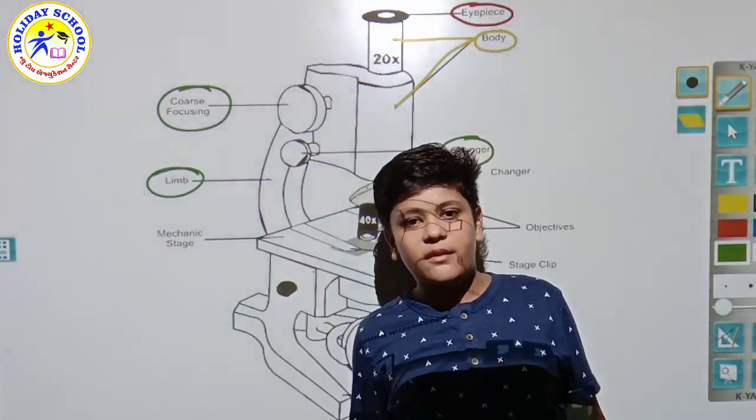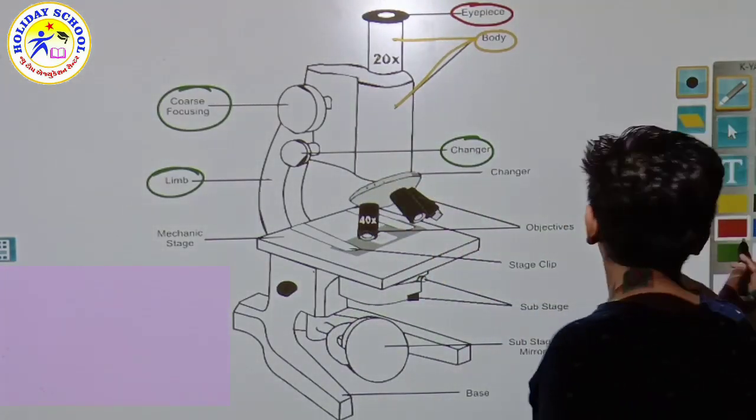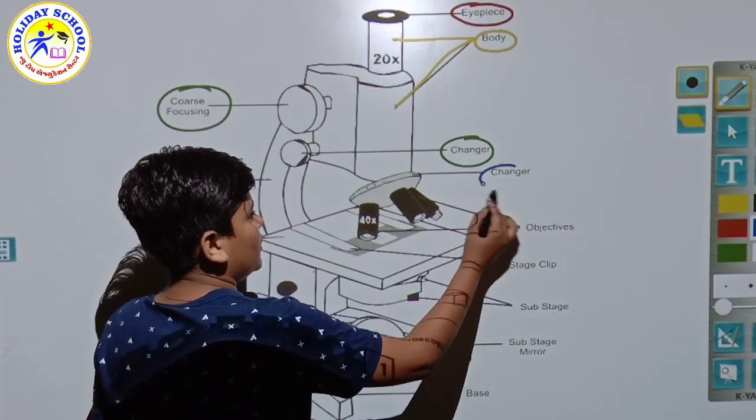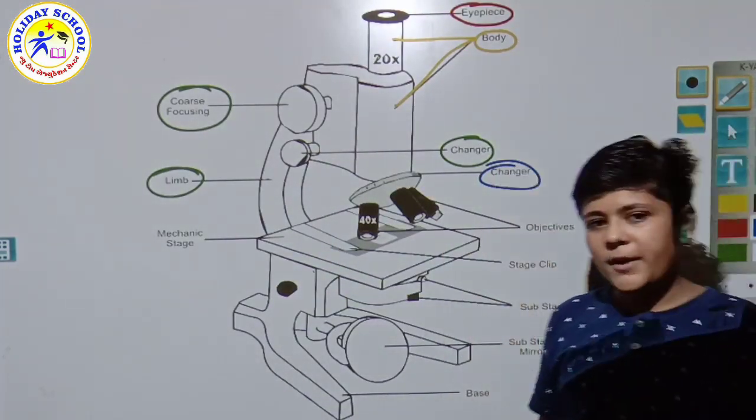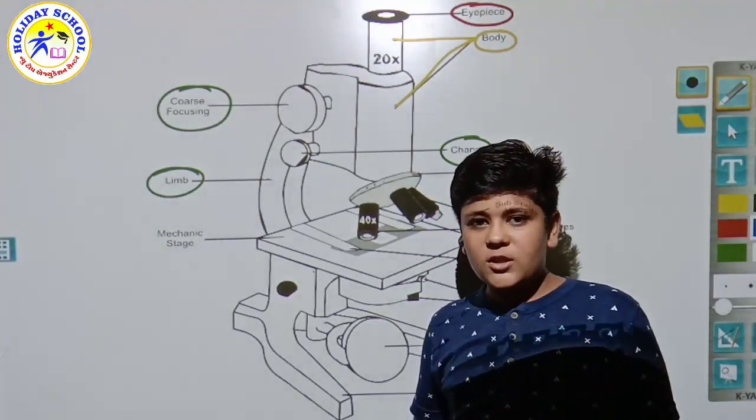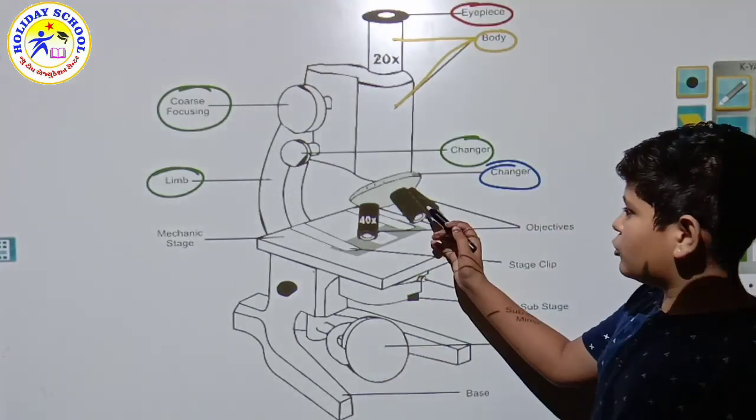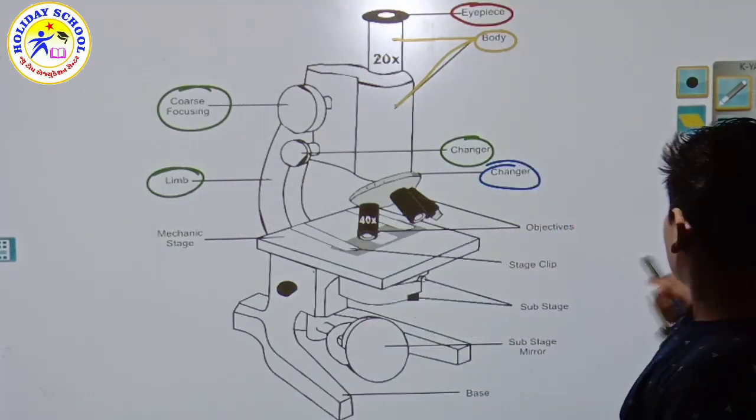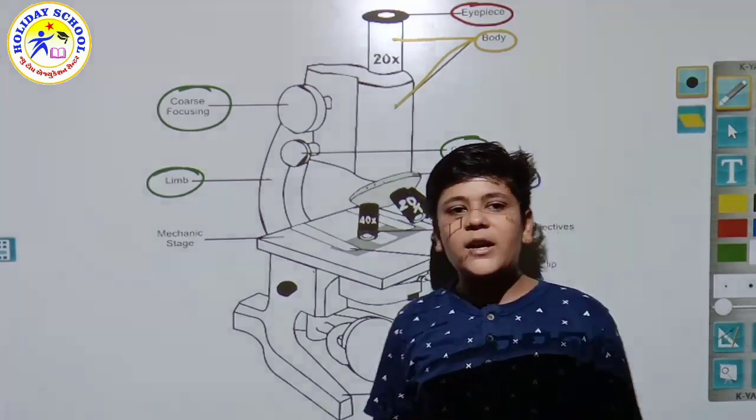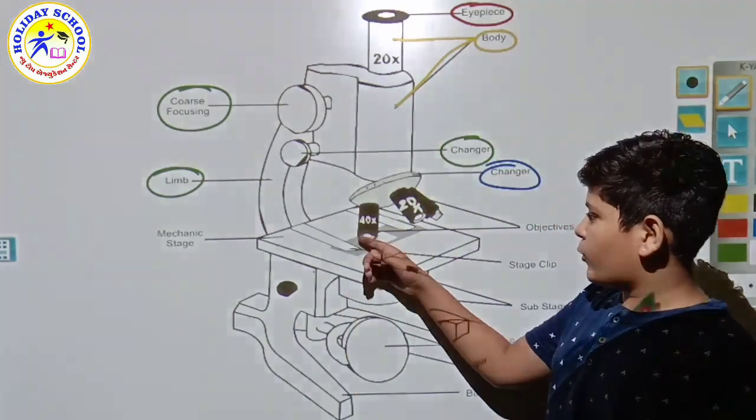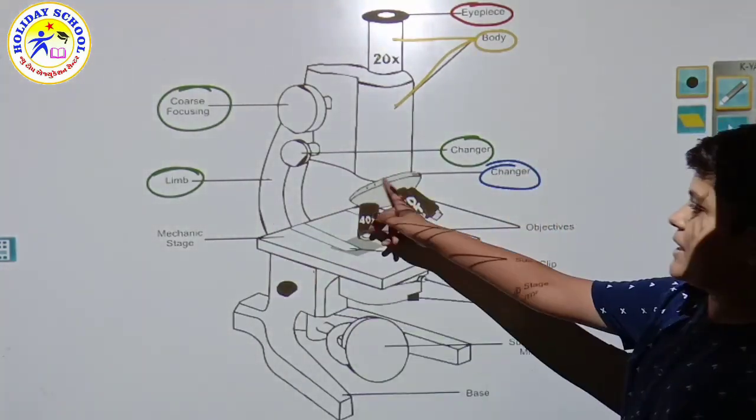After that, here is the changer. You might be confused - why are there two changers? Because different types of changes are done in different parts. This changer is for different lenses. Here it is written 40 times, here 20 times - different lenses are given: 40, 20, 100 times. To change those lenses, the changer is given there, this disc-like structure.